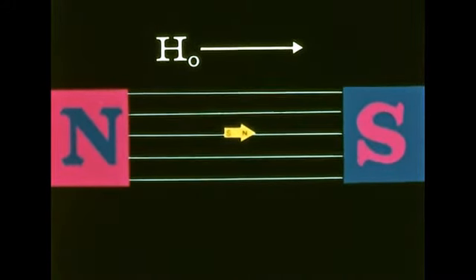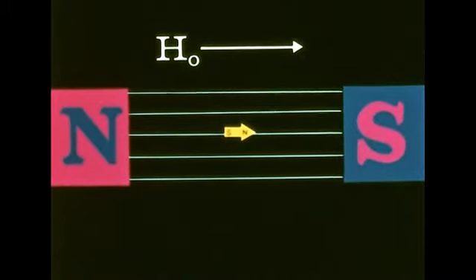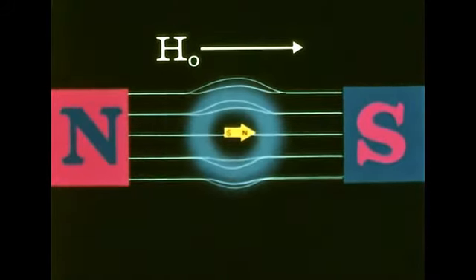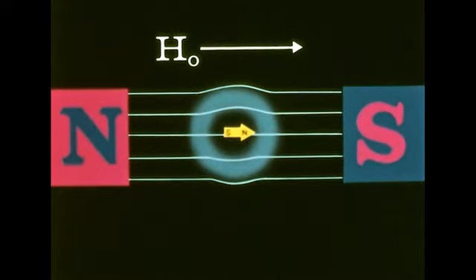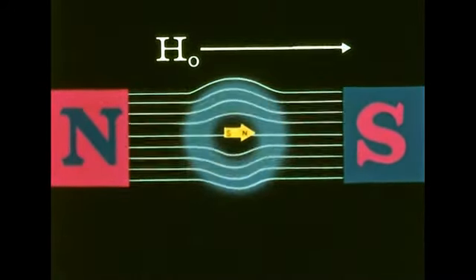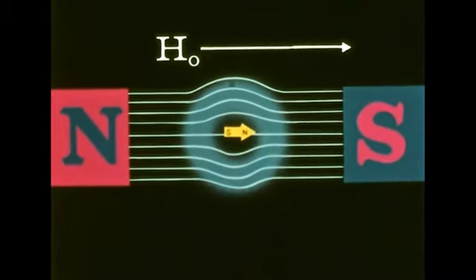Unlike protons in empty space, protons in molecules are somewhat shielded from the applied magnetic field by the surrounding electrons. The amount of shielding depends on the electron density around the proton, which is decreased by electron withdrawing groups. As electron density around the proton increases, a stronger magnetic field is needed to overcome the shielding and make the proton resonate. If all protons had the same shielding, they would all resonate at the same field or frequency.